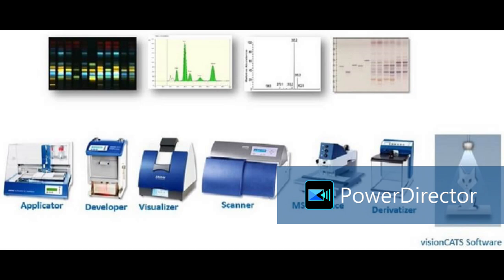So in the 1960s, it was a TLC technique. But in 2000, instrumental TLC came into the picture. Then software-controlled TLC came into the picture. Then in 2016, a standardized methodology was adopted in many pharmacopoeias.